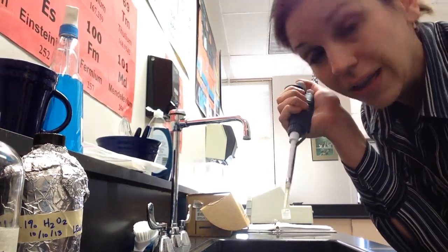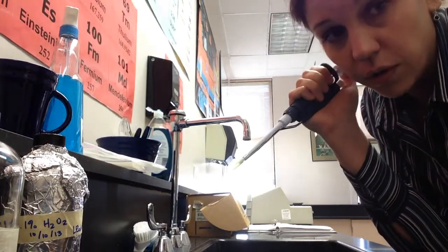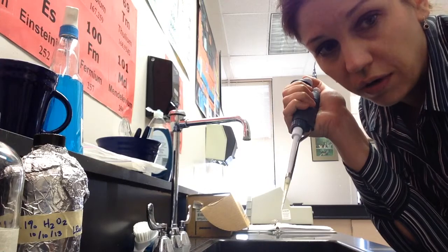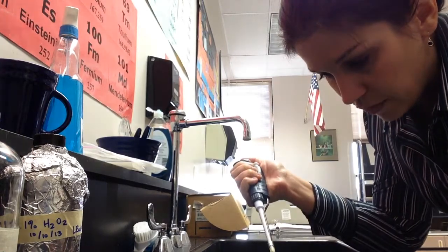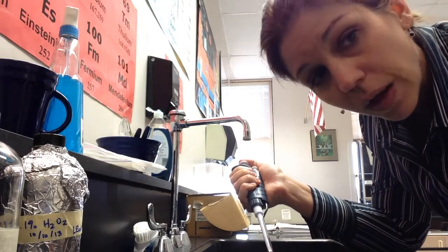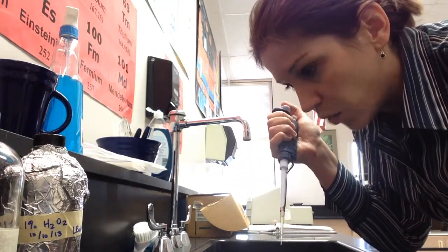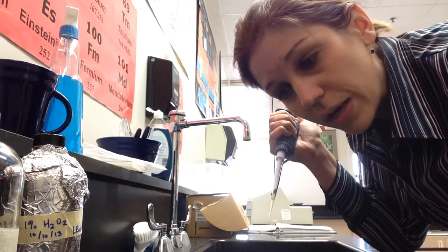Don't confuse the micropipettors. If they're next to one substance, leave them there so we don't have contamination between our stuff. So that's your quick tutorial on micropipettors for those of you who have never used them before. If you want to practice, I'll have a practice one available for you as well, and you can just practice with water before you start messing with your reactants, just to make sure you don't goof anything up inadvertently.